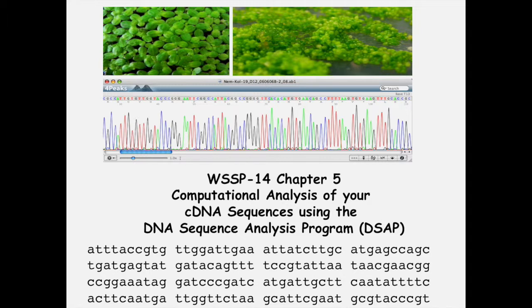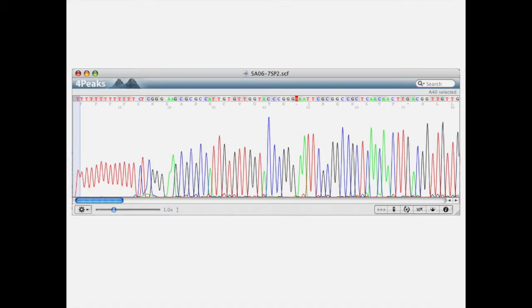Okay, let's get started. Today we're going to be talking about DSAP, the DNA Sequence Analysis Program, and how we start analyzing sequences. These next few presentations that you're going to watch are going to help you analyze your practice clones. So let's get started.